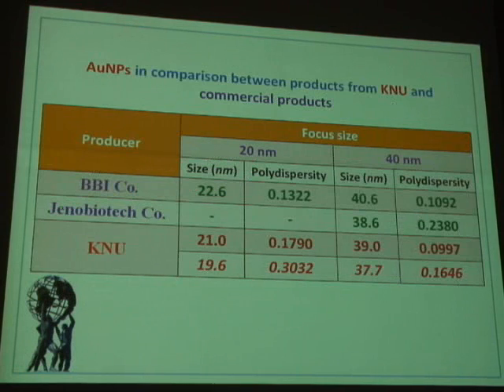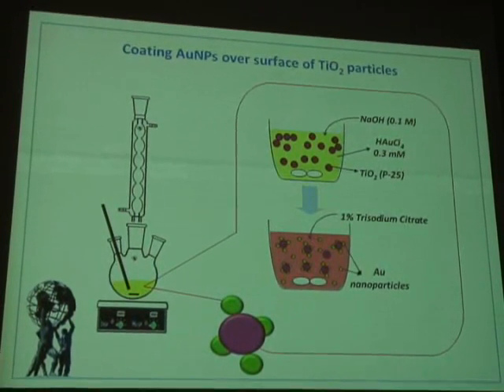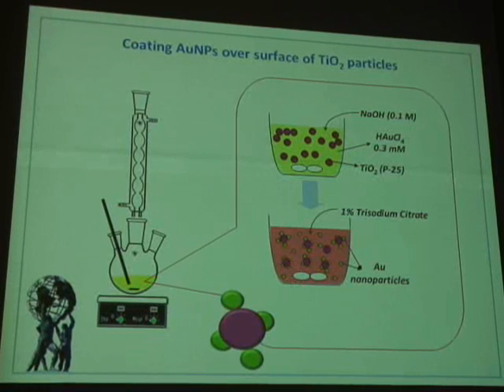We also compare the product with the commercial products from BBI company and Geno Biotech company. In comparison of size and polydispersity, we affirm that our product can be used for IVD testing. And based on the formation of gold nanoparticles in aqueous solution, we predict that with the action of titanium, gold particles from the solution can be deposited onto the surface or grow on the surface of titanium to make the gold covered titanium.